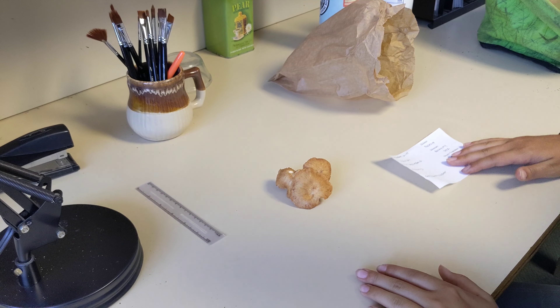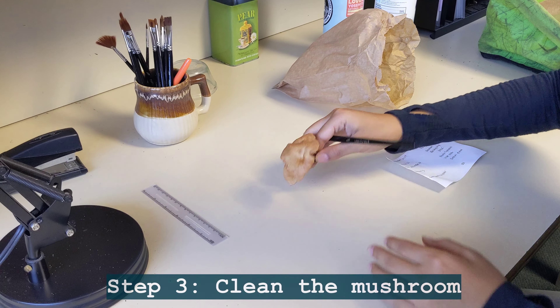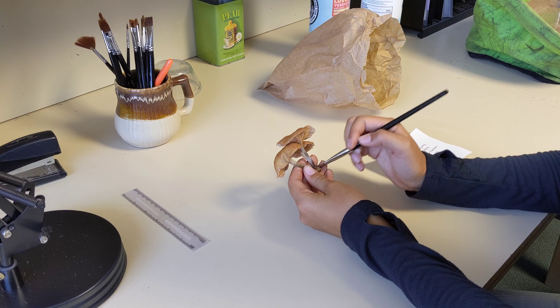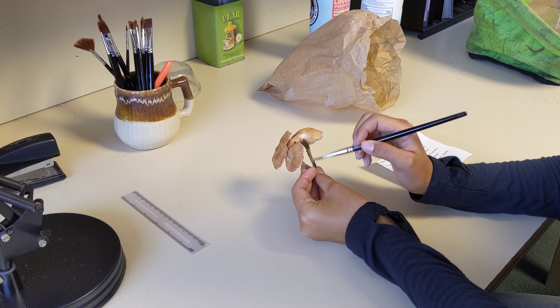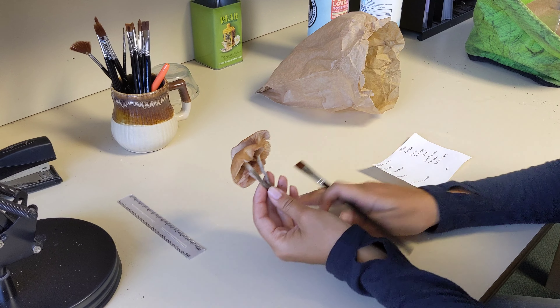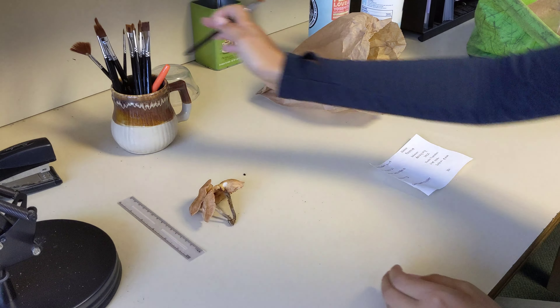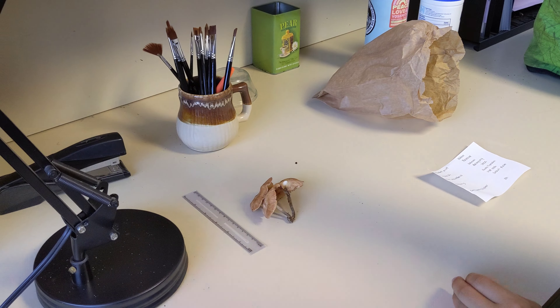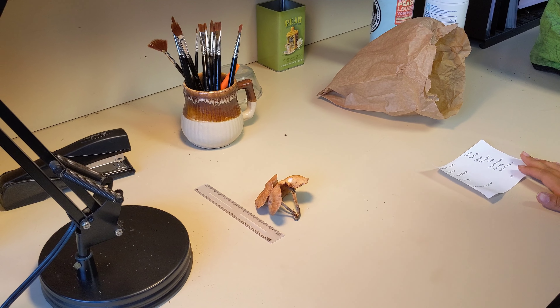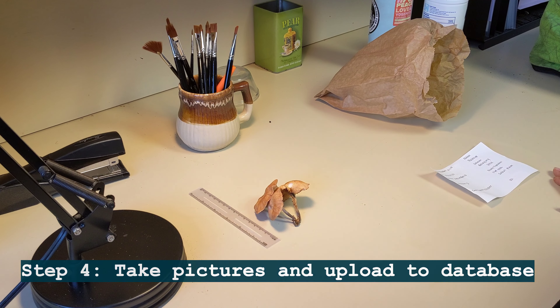So the first thing I would do is remove excess dirt that we don't want to be storing with the sample. This specimen is already pretty clean, but I can remove a little bit of soil left on from the field. Then we'll take a picture for the photo database next to a ruler, so that way we can remember the size of the specimen.